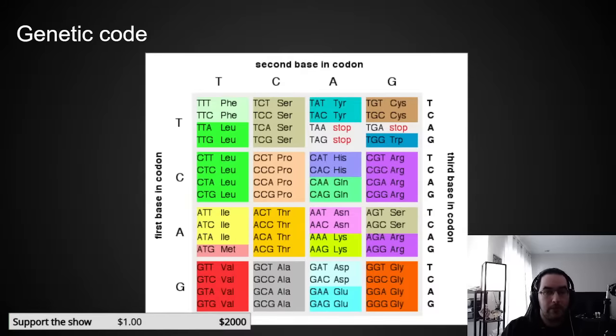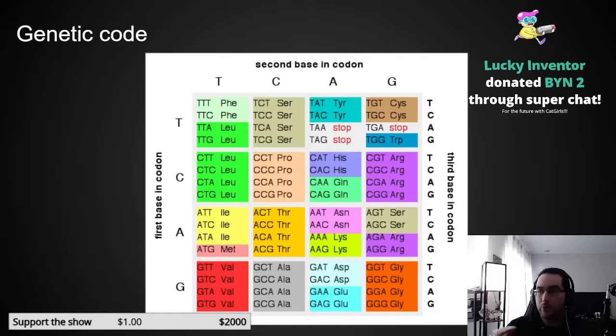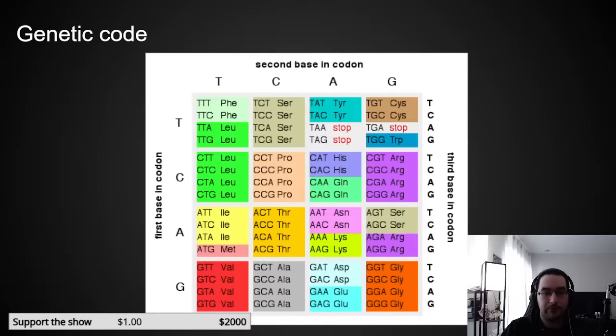Because if you're using rare codons, what can happen is as the protein is being transcribed or translated, right? Like as the protein is being made, the population of the tRNA available in the cell can literally run out. And if that happens, protein synthesis just stops, the ribosome ejects the protein unfinished, and you have a bunch of unfinished garbage in your cell, which will not be doing the thing that you want it to be doing. So it's very important that when you're coding, you're picking codons that your organism likes. And you can find reference tables for most of the standard lab organisms for which codons you're supposed to be using. And also a lot of the coding programs will have a feature that will basically do this for you. And I'll show you that later. But yeah, so this is codons. Very important, but this is sort of the basic building blocks. Like this is the closest to, you know, binary or a binary equivalent of DNA.